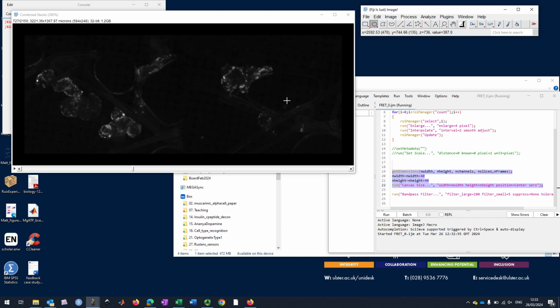After that, I go and make myself a coffee, tea, buy myself some sweets, and so forth, because this will take quite a bit of time, depending on your PC. You can see we have 2150 frames altogether. It seems to be doing several frames per second, so it's not going to be like 1 hour, but it is quite slow.